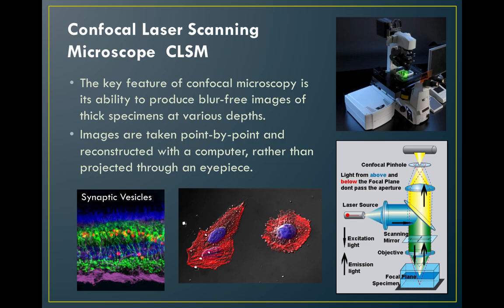This is a cool microscope, the confocal laser, because it can take 3D pictures and produce them on a computer screen so that you can actually rotate the specimen around. You can go into the specimen, I believe. Yes. All right. So this is a cell membrane. This is really an amazing picture of a cell membrane. And obviously we're not going to tell you what the parts are. And these are just, I don't know what kind of cells these are. These aren't red eggs. They're cells.